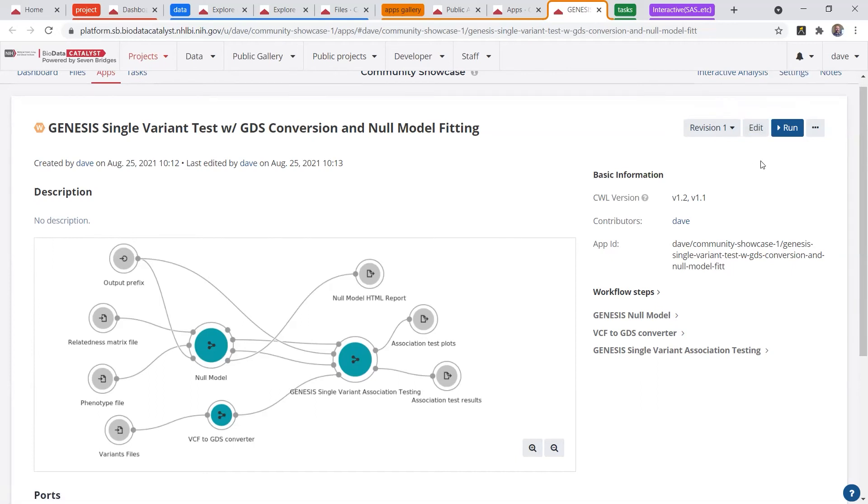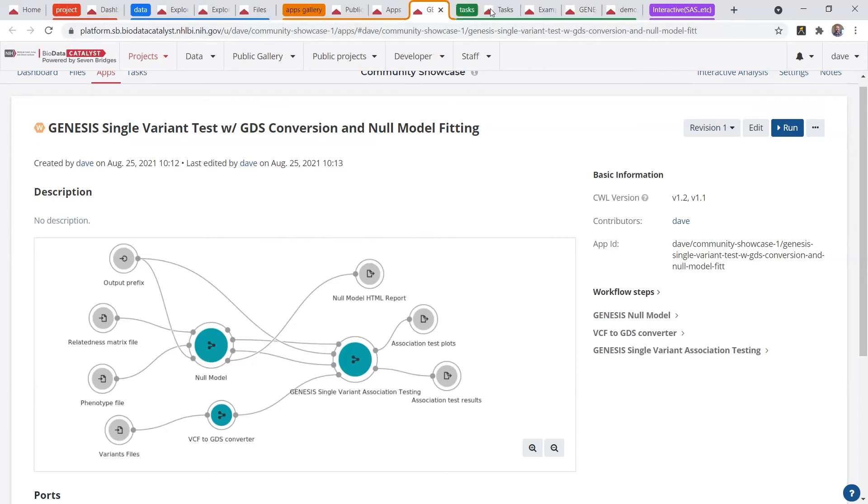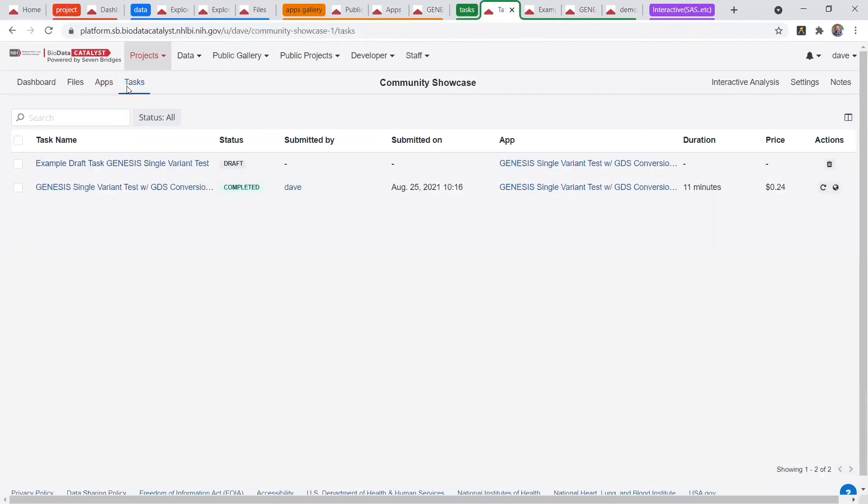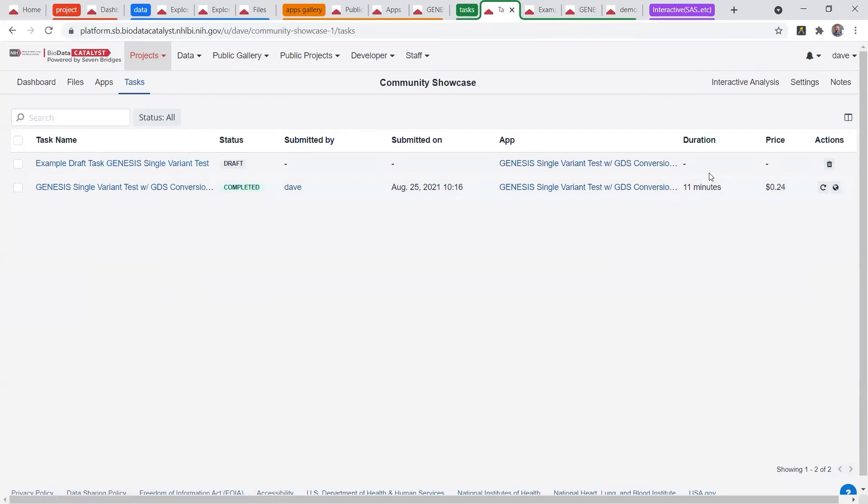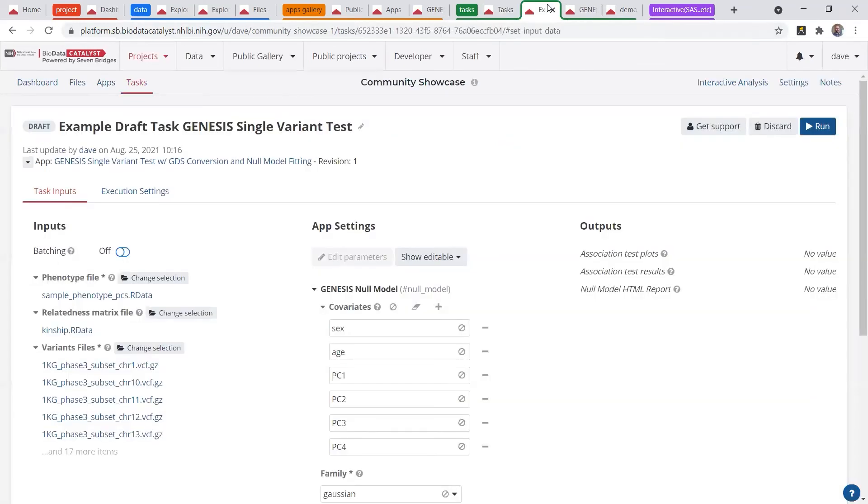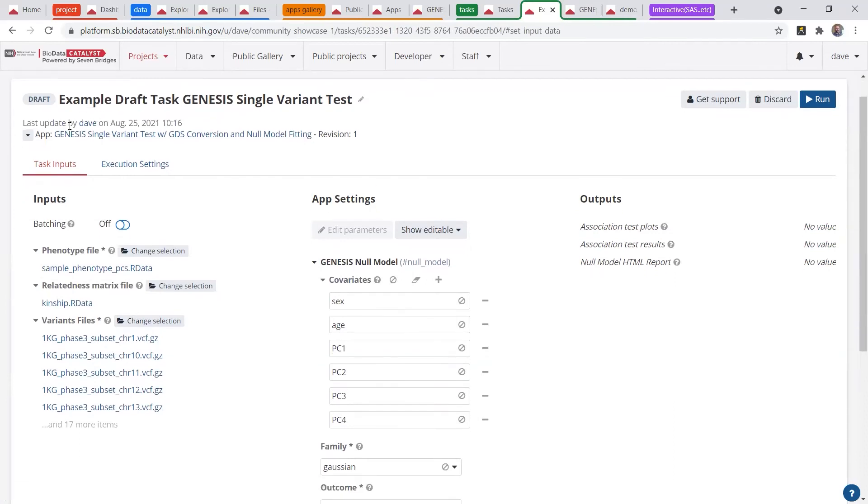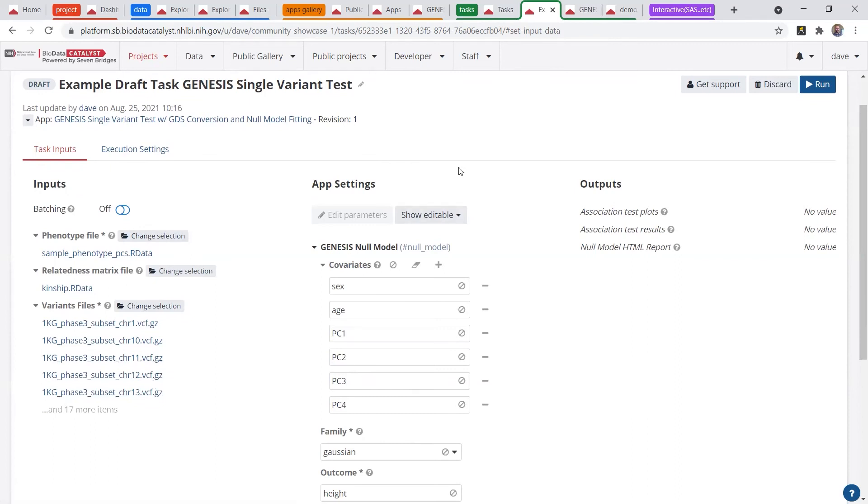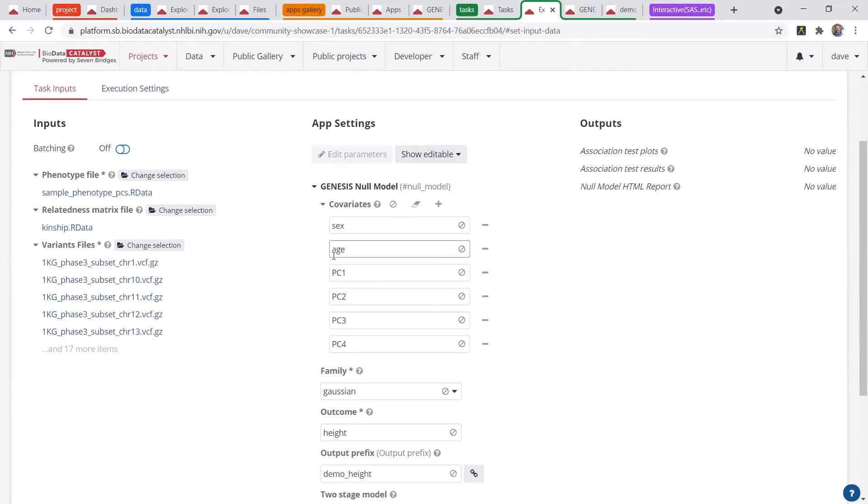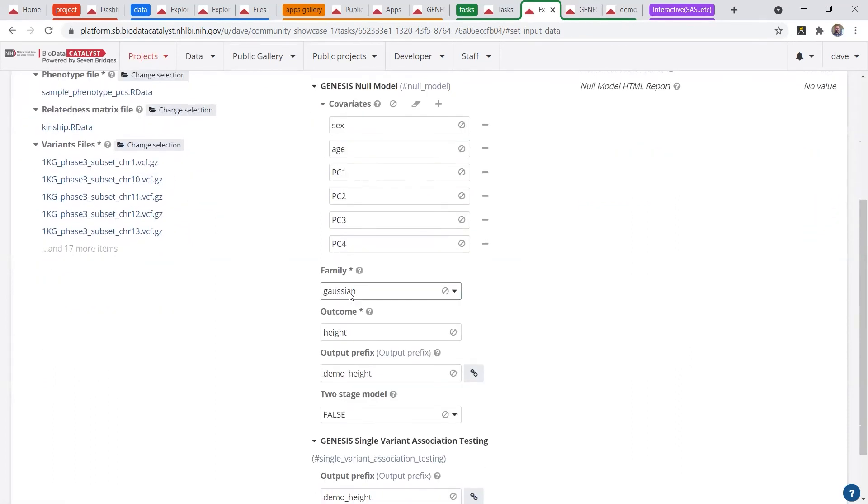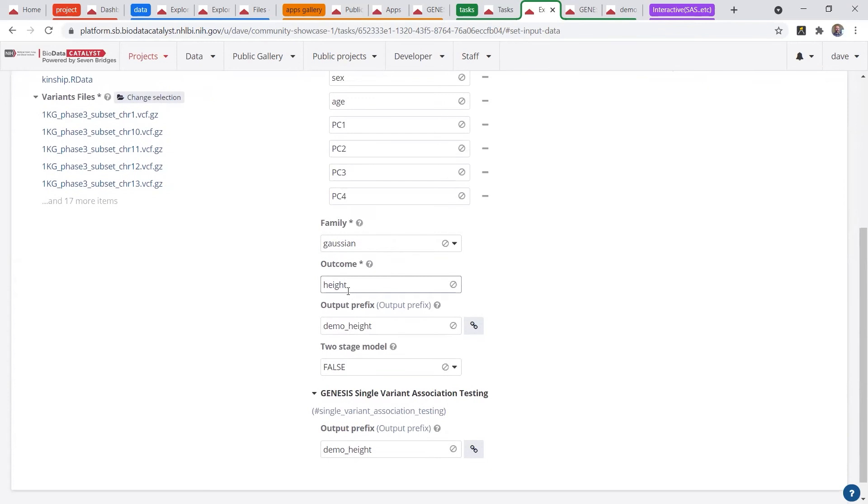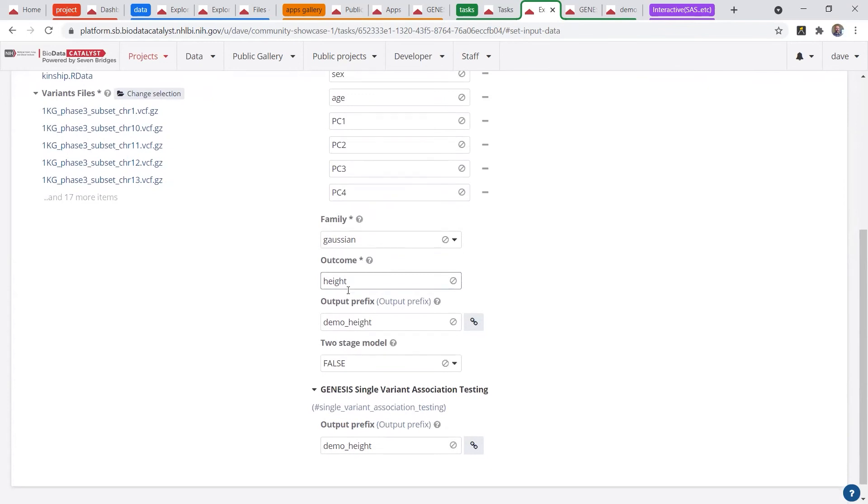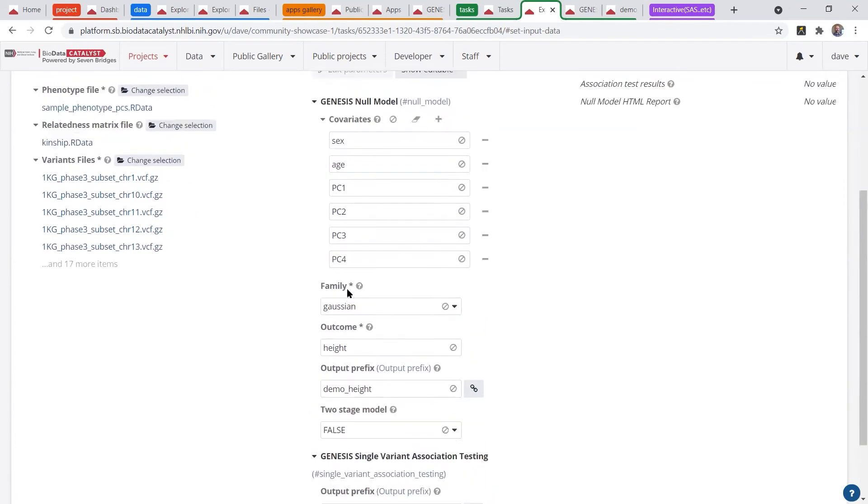So when you run an analysis task, it takes you to the tasks page, and this will give you a list of all the analysis that you've done, the duration, as well as the cost. When you run an analysis, it'll start you off in a draft task, and you'll fill in the appropriate files on the left side, and you can specify some app settings, including covariates in this example, outcome, column, etc.